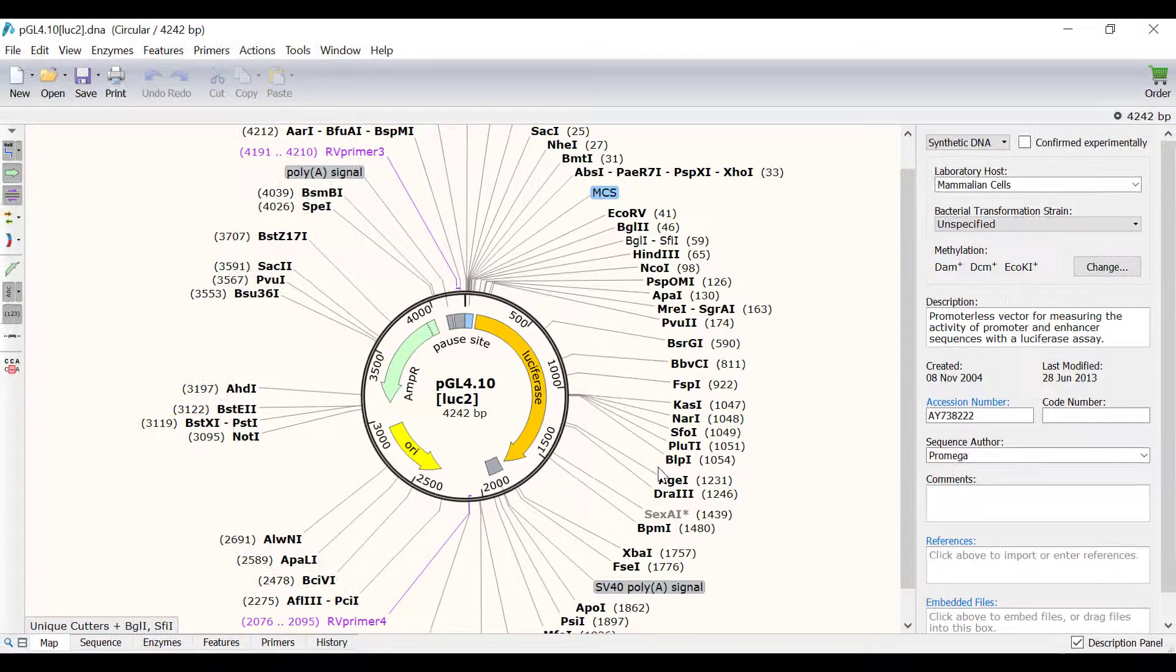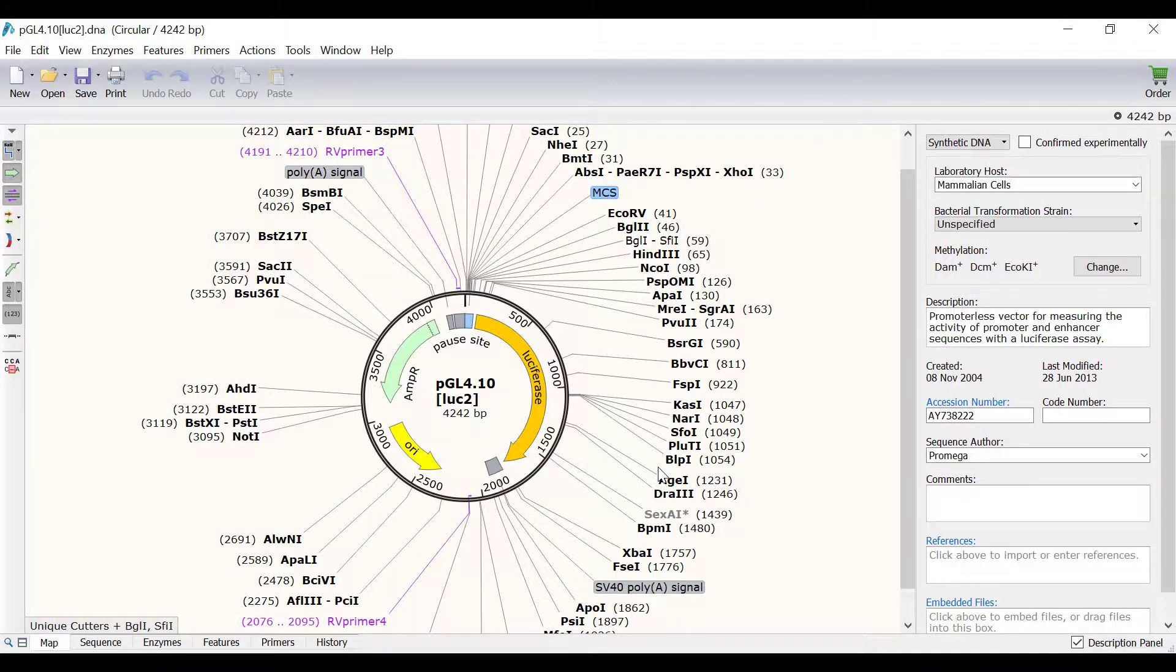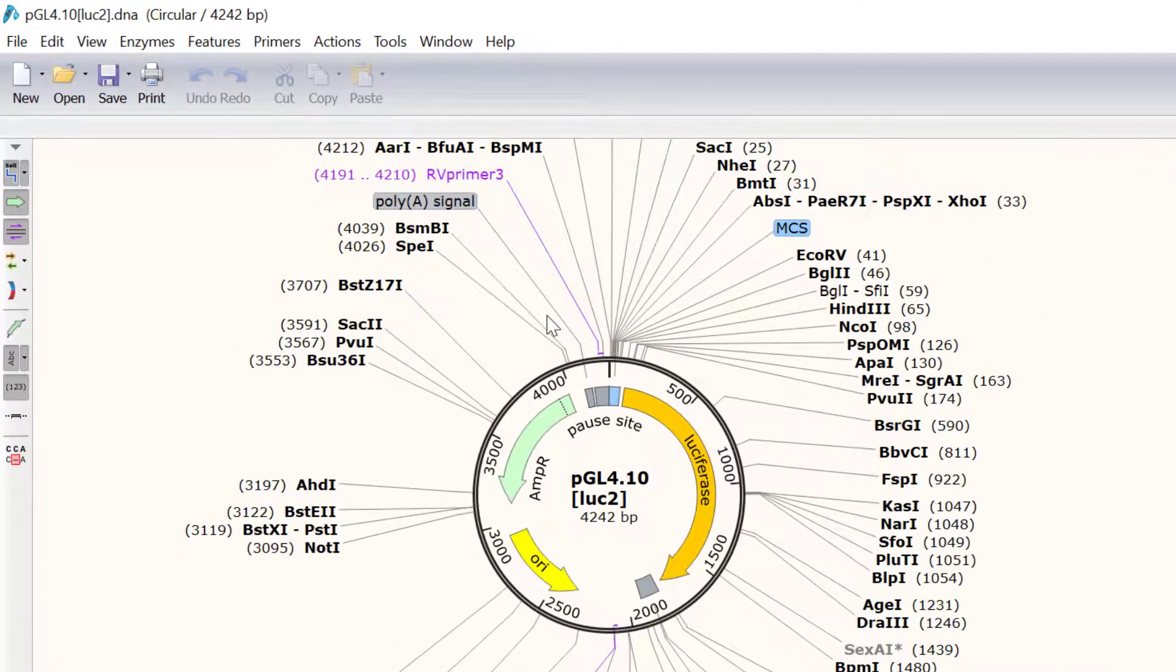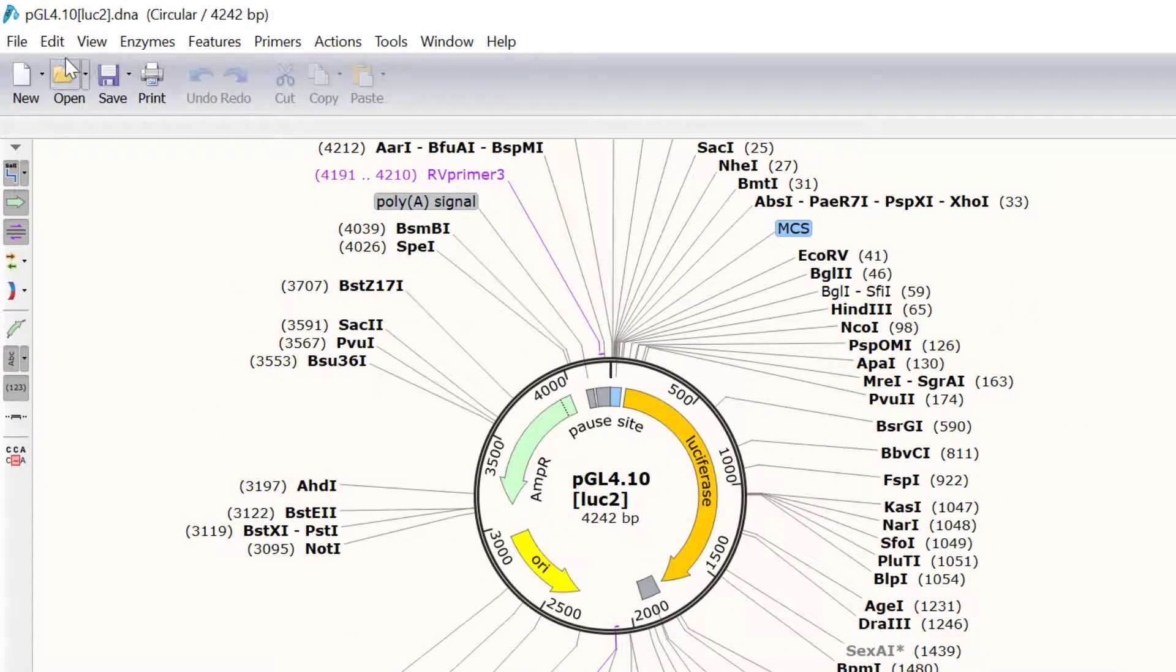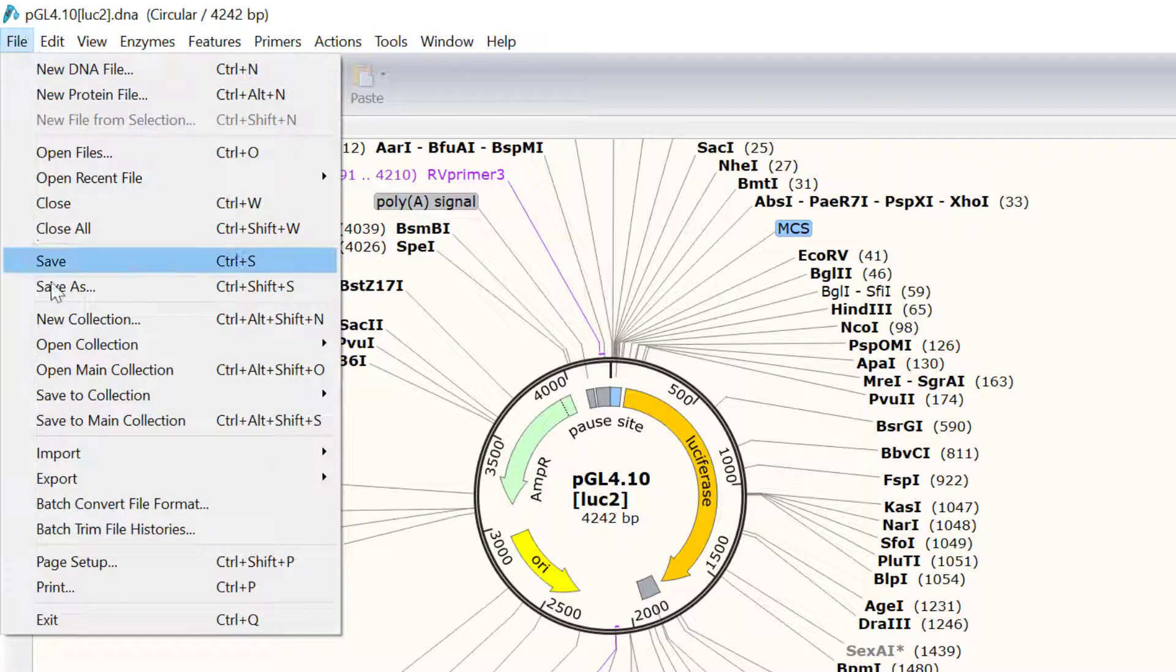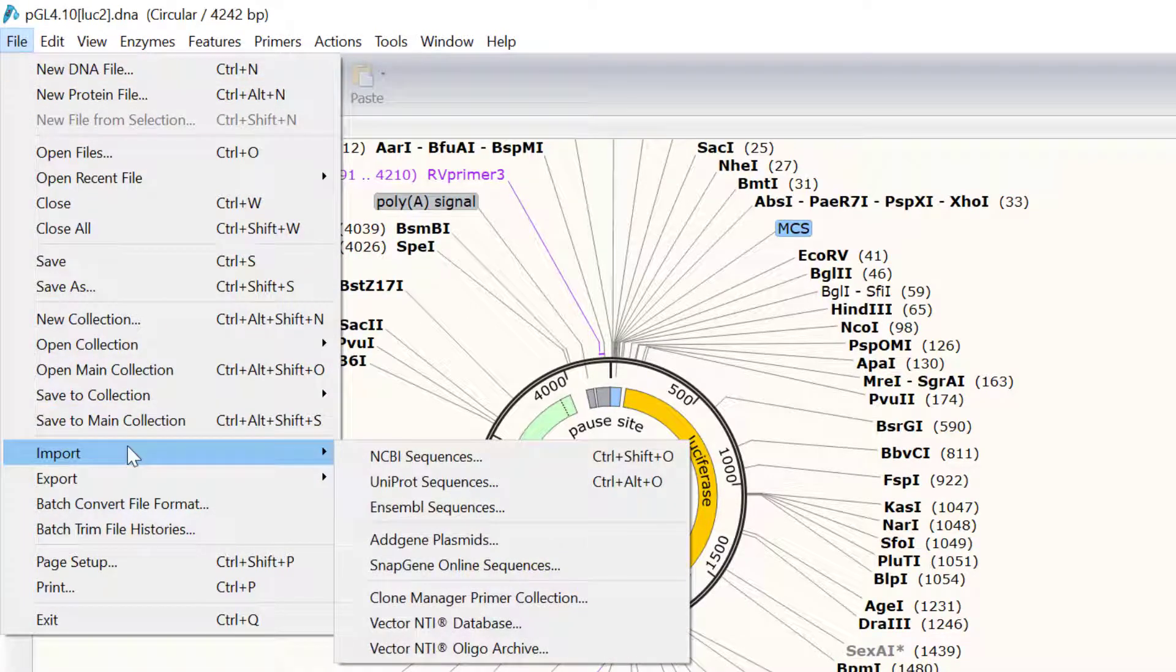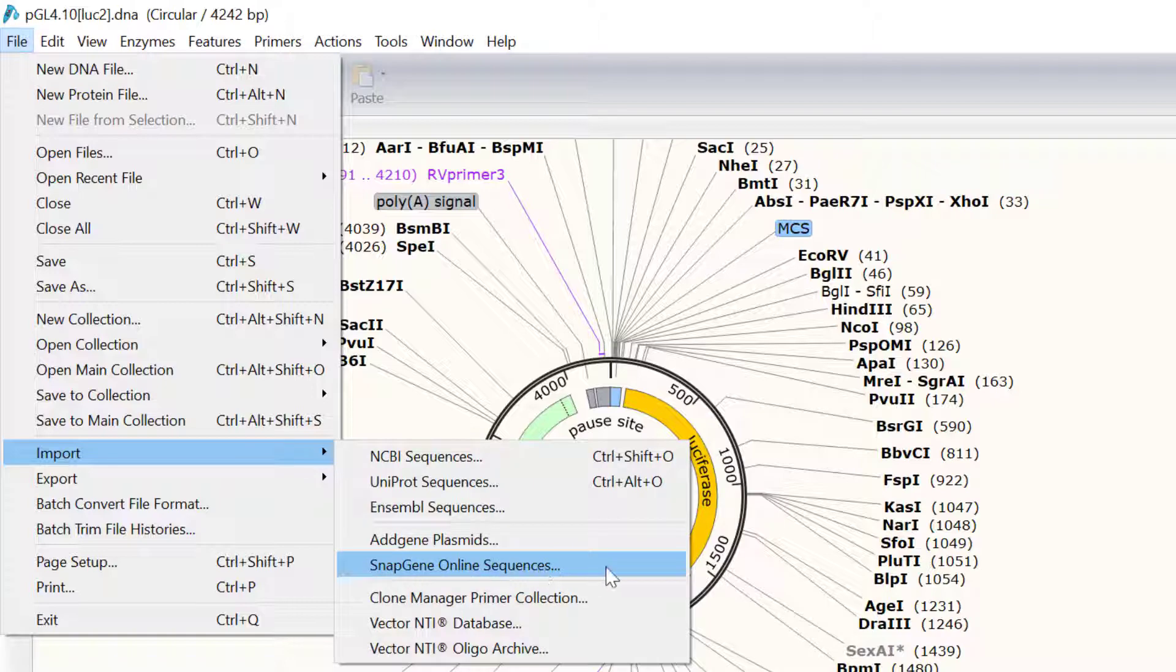An alternative way to import sequences and files into SnapGene comes from within the software. To do this, simply go to file import and then select the desired database and follow the same steps as before.